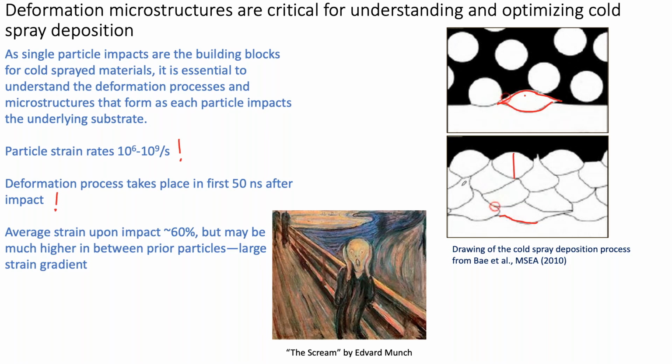In terms of ceramic substrates, to be honest, I haven't done a lot of work on ceramic substrates. So I kind of have to think about that. The key would be the adhesion. So how well do these impacting particles actually adhere to a ceramic material? And I haven't done a lot of that. I've done almost exclusively metallic depositions on metallic materials. I think I've read some literature where you can put down thin layers on ceramic materials, but adhesion is going to be the key concern.